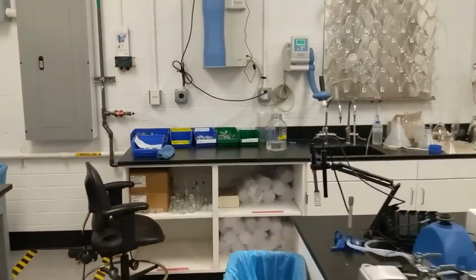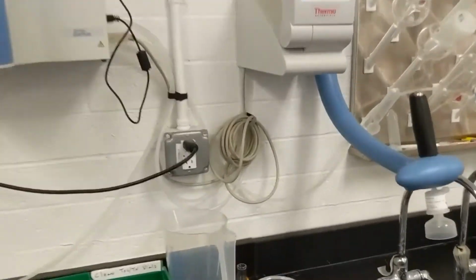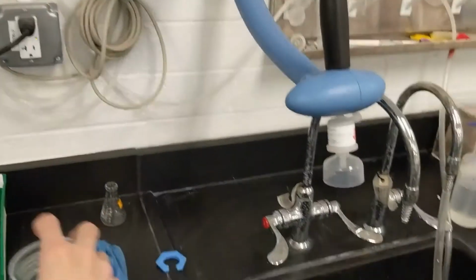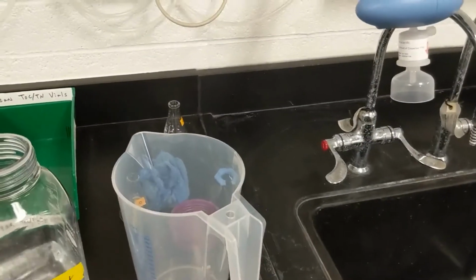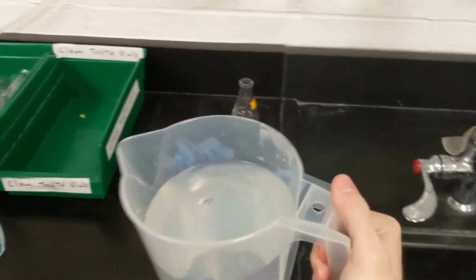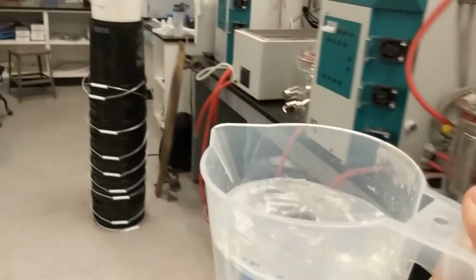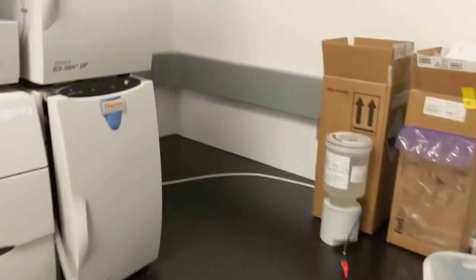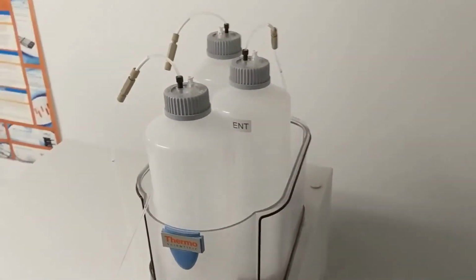The easiest way to do that is to come over here, or wherever your nano pure station is, and fill up something like this with your nano pure water. So let's do that really quick. All right, so now that our water pitcher is full, let's take it back over to the IC and fill up these bottles.